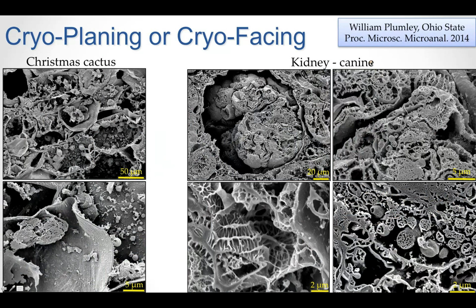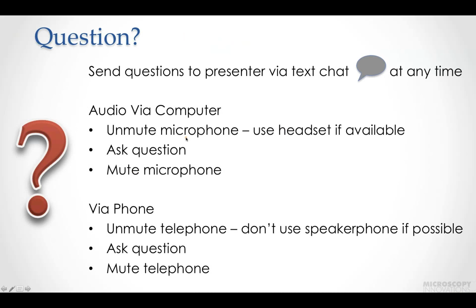And here we have canine kidney that was prepared in the same way. I should mention the kidney was prefixed prior to this process, glutaraldehyde osmium fixation, and then extensively water rinsed prior to the cryopreparation. So there were no questions here, so I will move on.